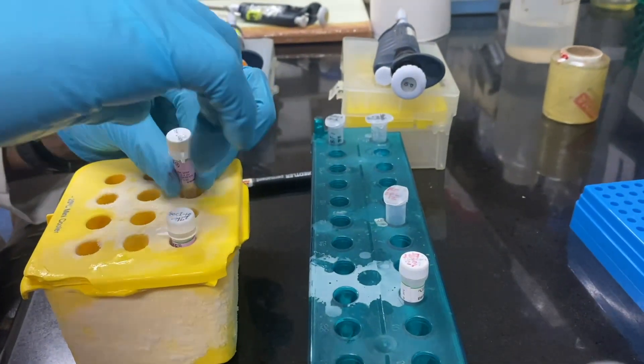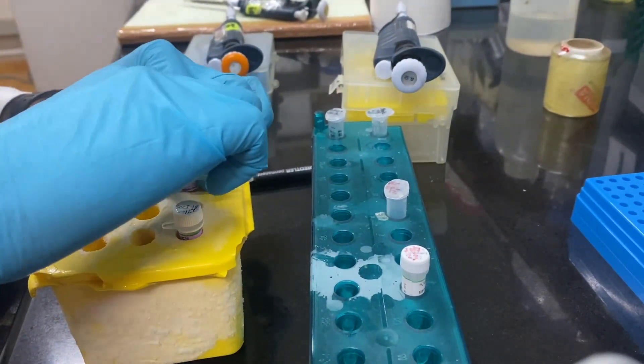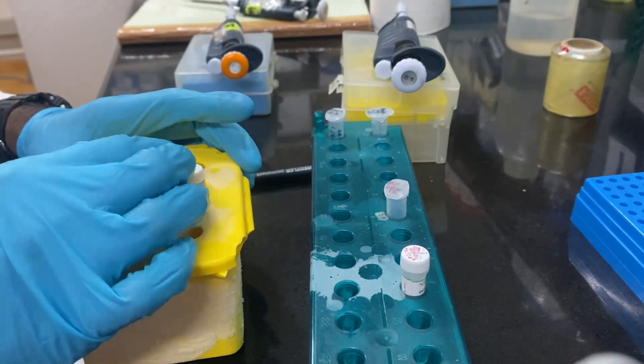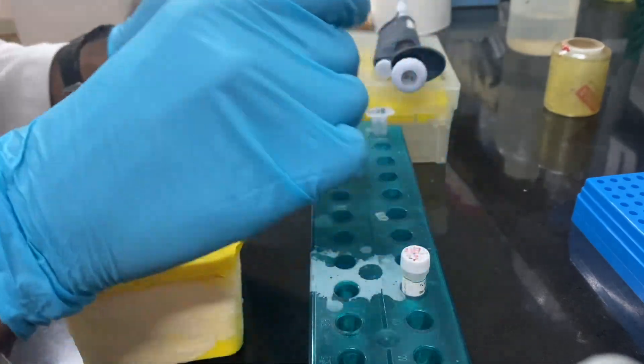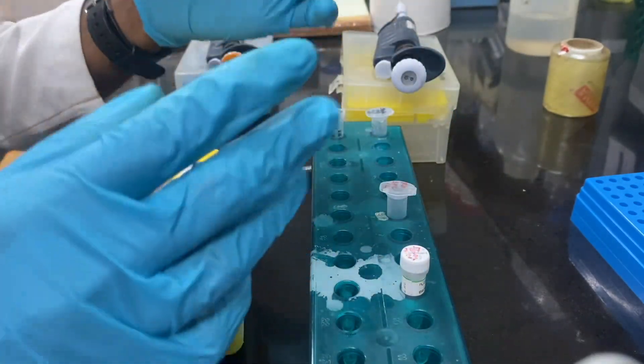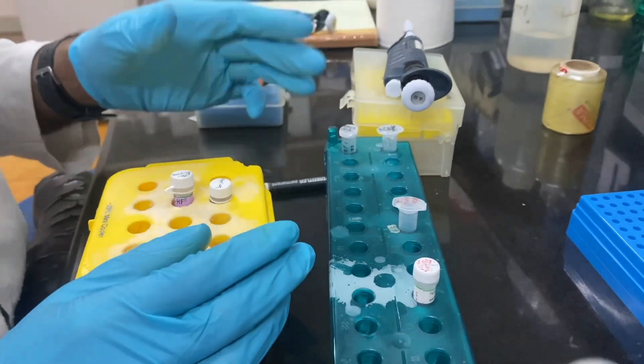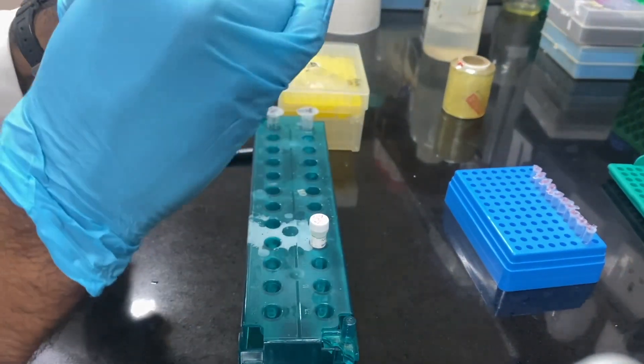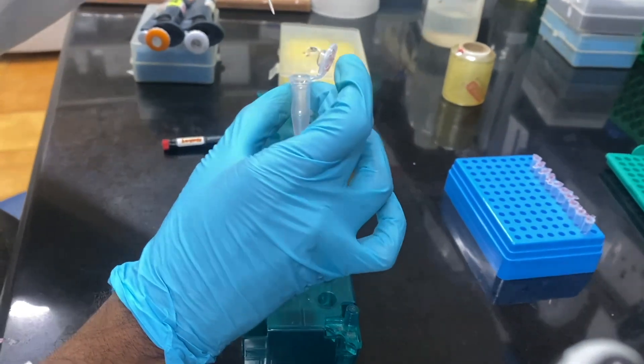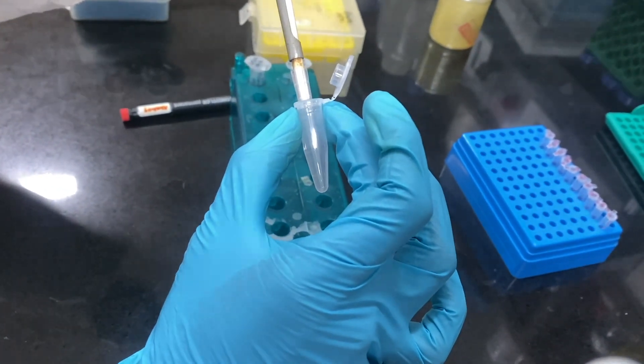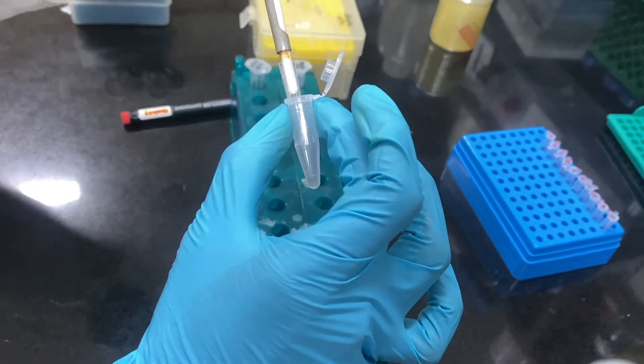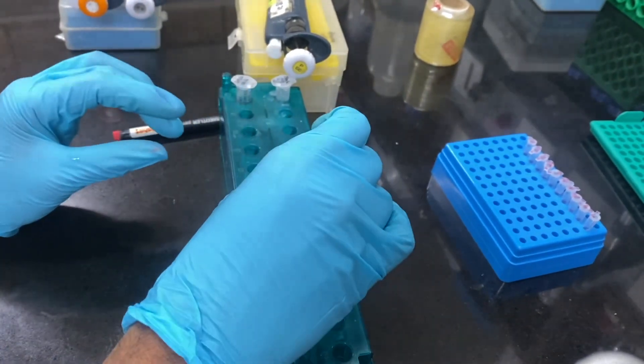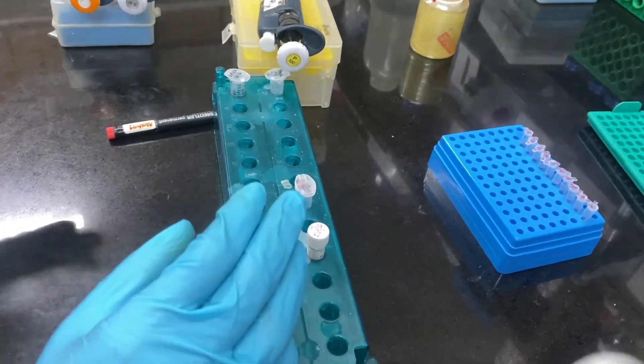Now both enzymes have been added. We will mix it with the pipette first and then we will give a short spin to this reaction tube and we will keep it at 37 degrees Celsius for one hour. After adding each component we have to gently mix with the pipette and we can give a short spin also to the tube and we can keep it at 37 degrees Celsius.